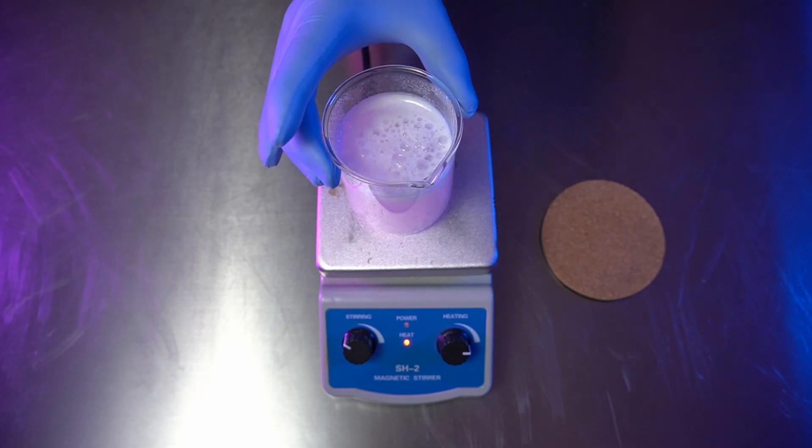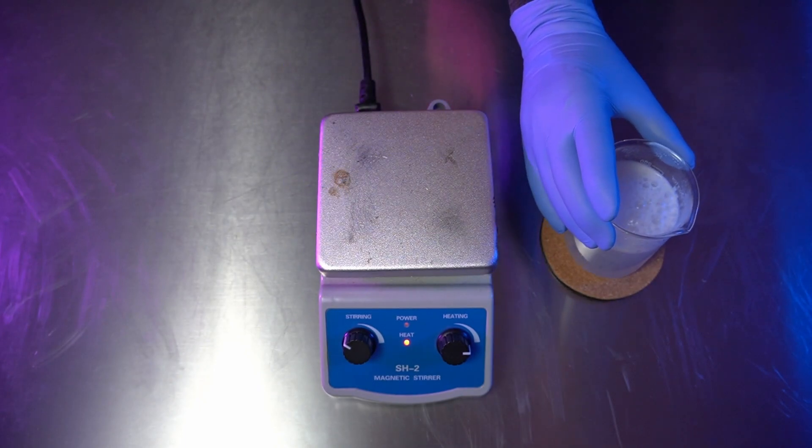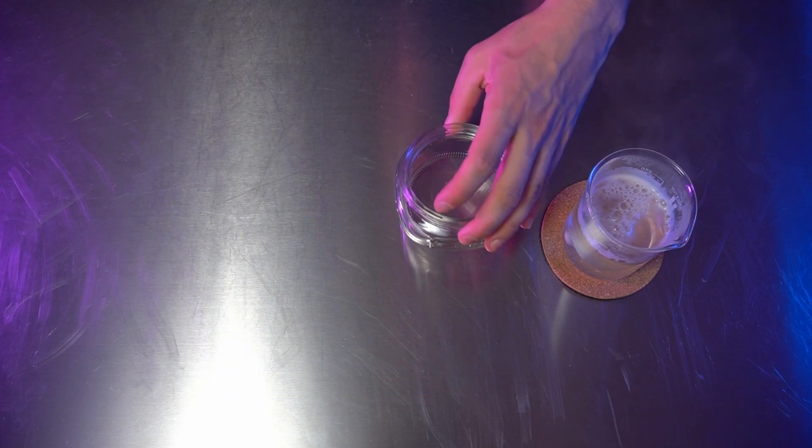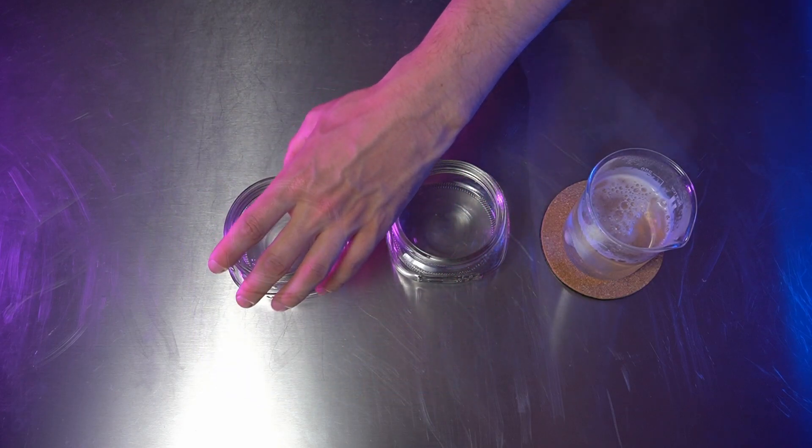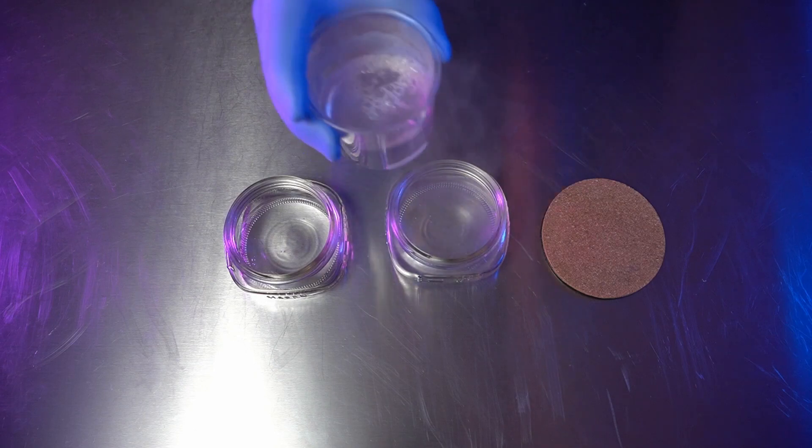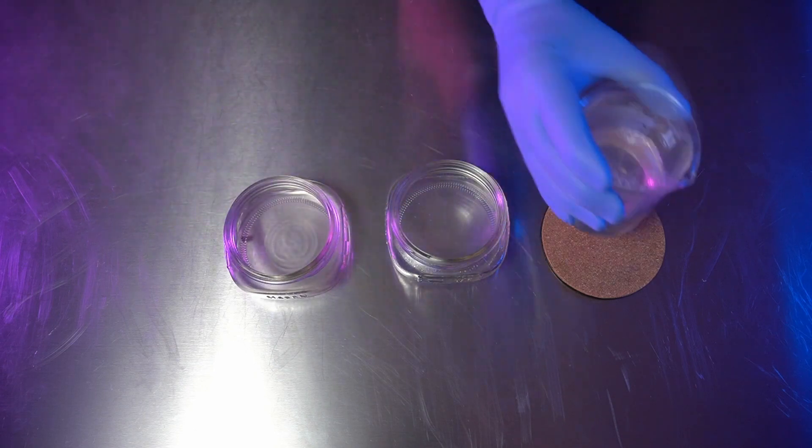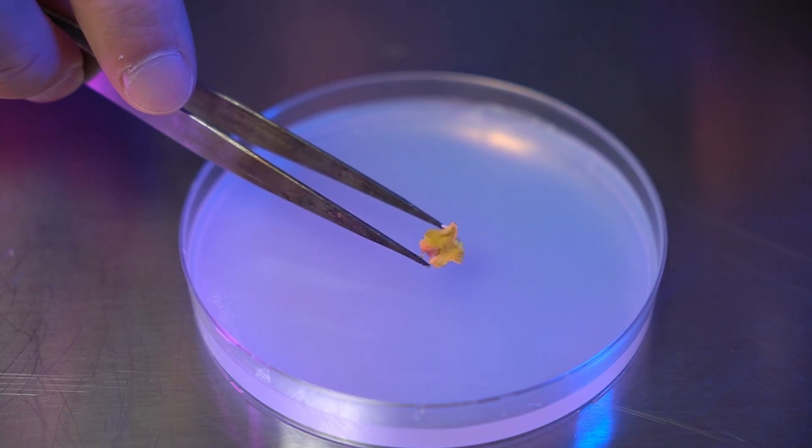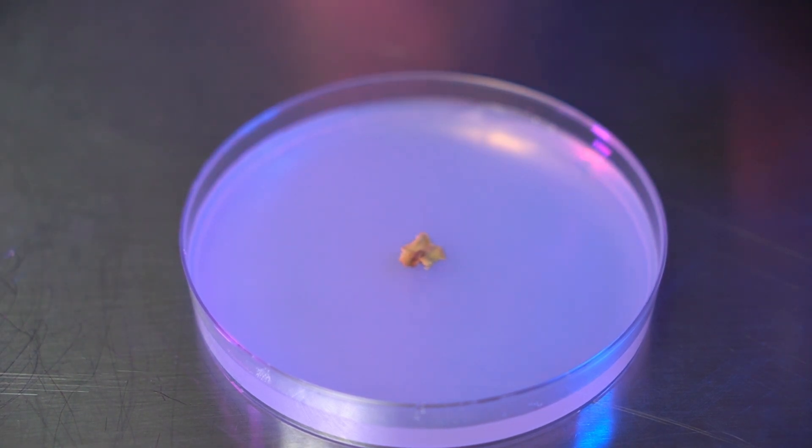To activate the gelling effect, you need to bring the agar to a boil. After that, we can pour it into our containers. Follow the same steps we outlined for inoculating filter paper to inoculate your agar containers.